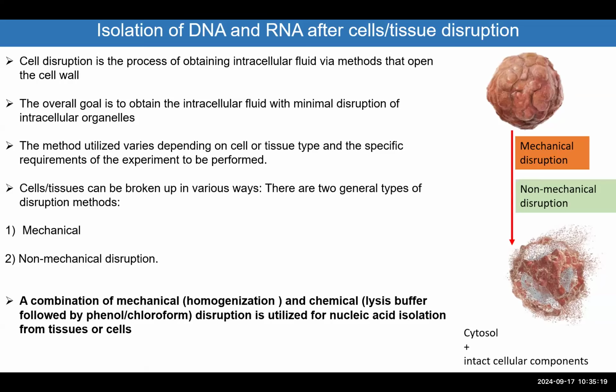Imagine we do the disruption. And as I explained in the previous lecture, the disruption itself, by mechanical or non-mechanical ways, is not enough for the isolation of macromolecules.